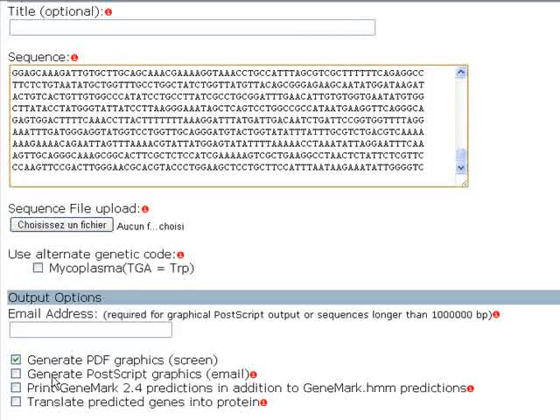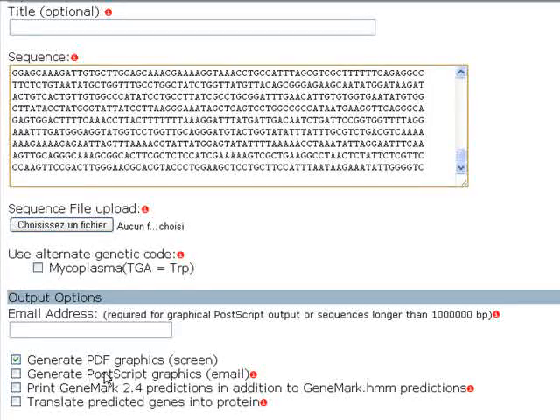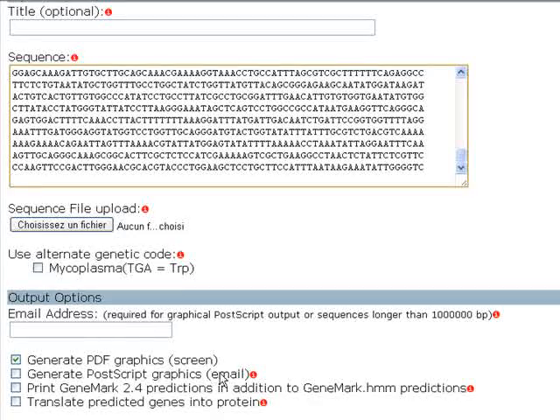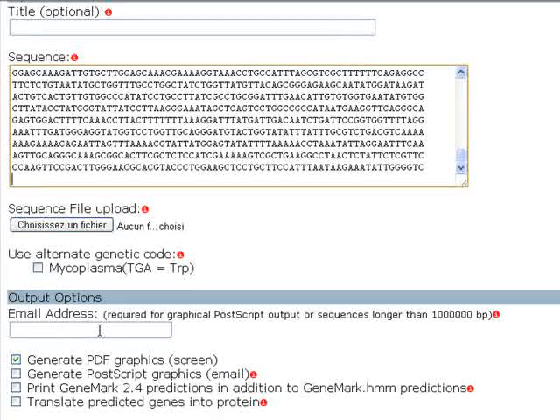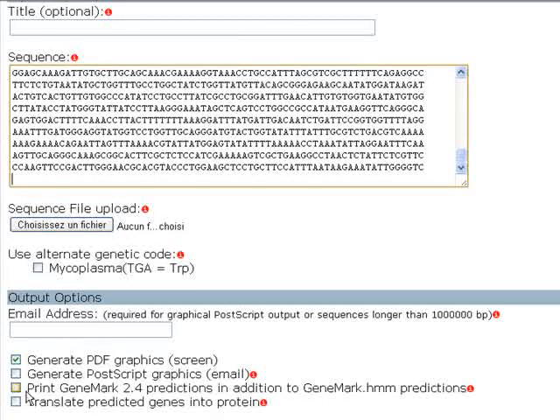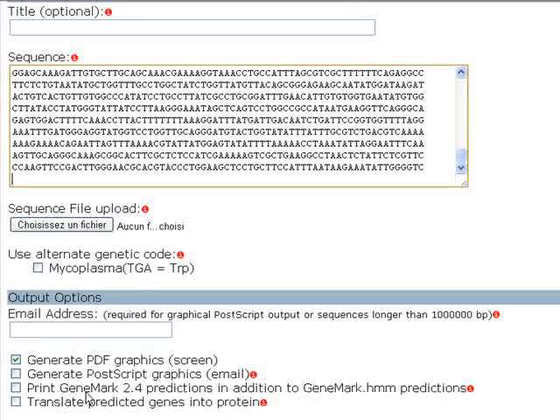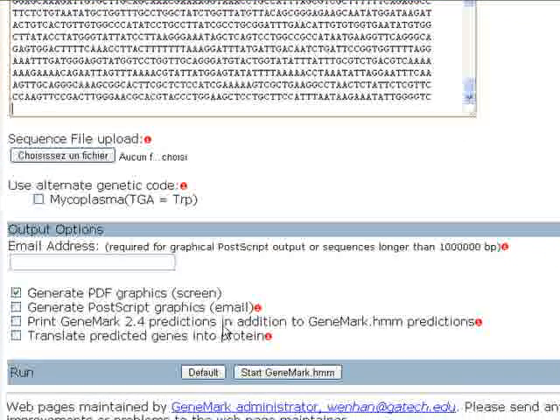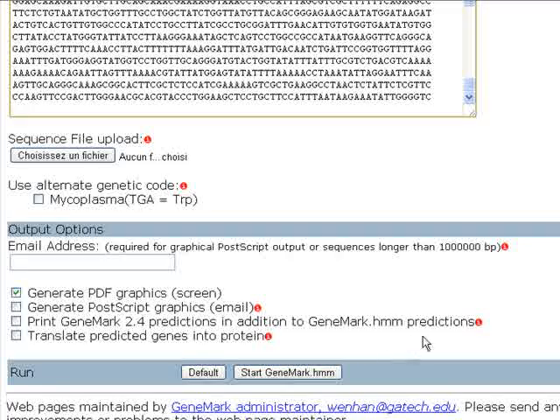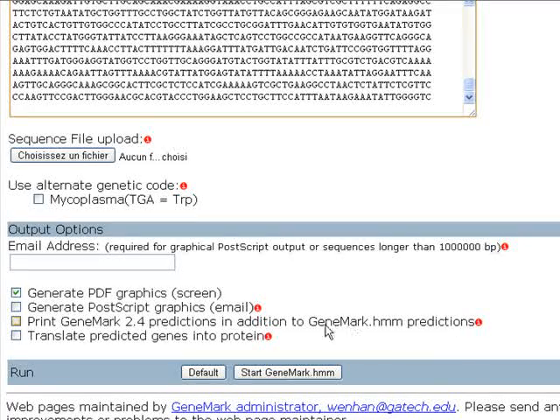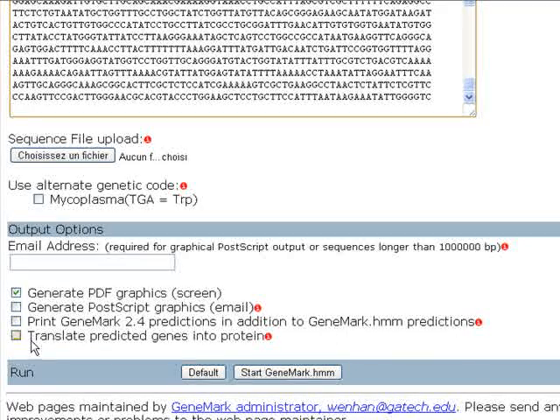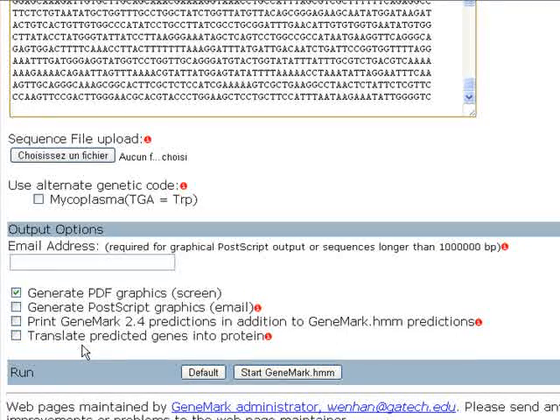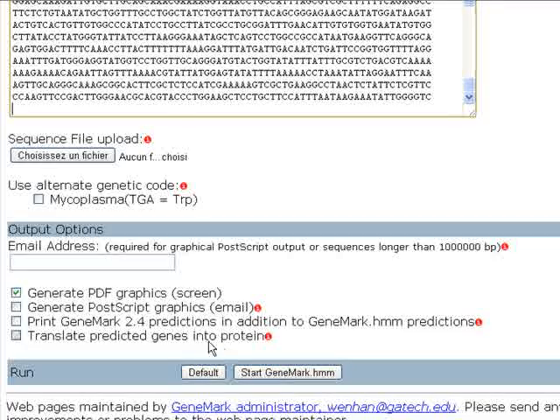The second option is to generate postscript graphics which requires your email address. The third option is to print GeneMark 2.4 predictions in addition to GeneMark.HMM predictions. And the fourth is to translate predicted genes into protein.